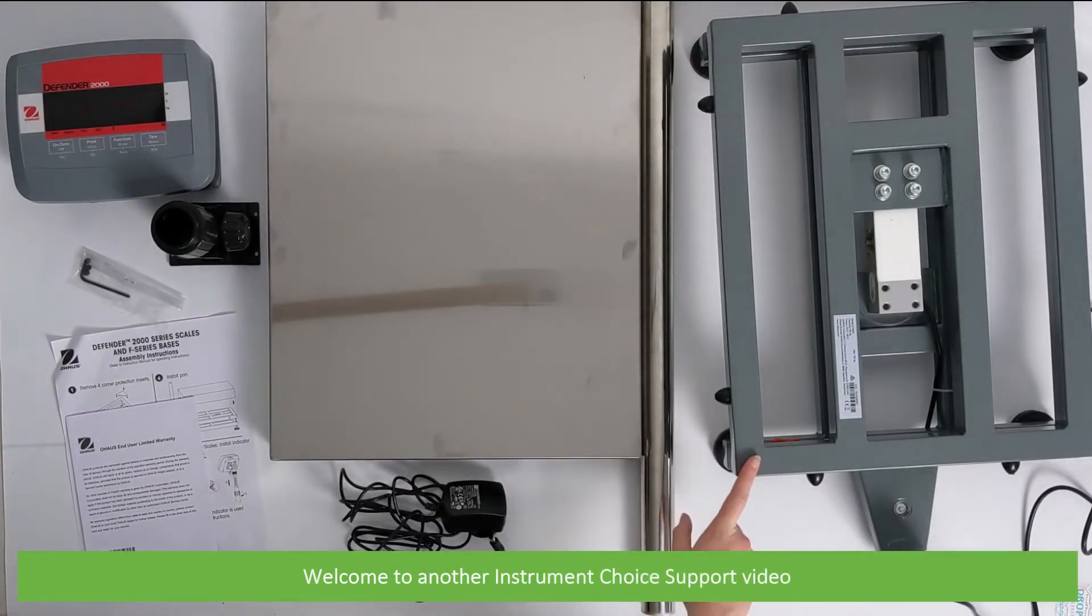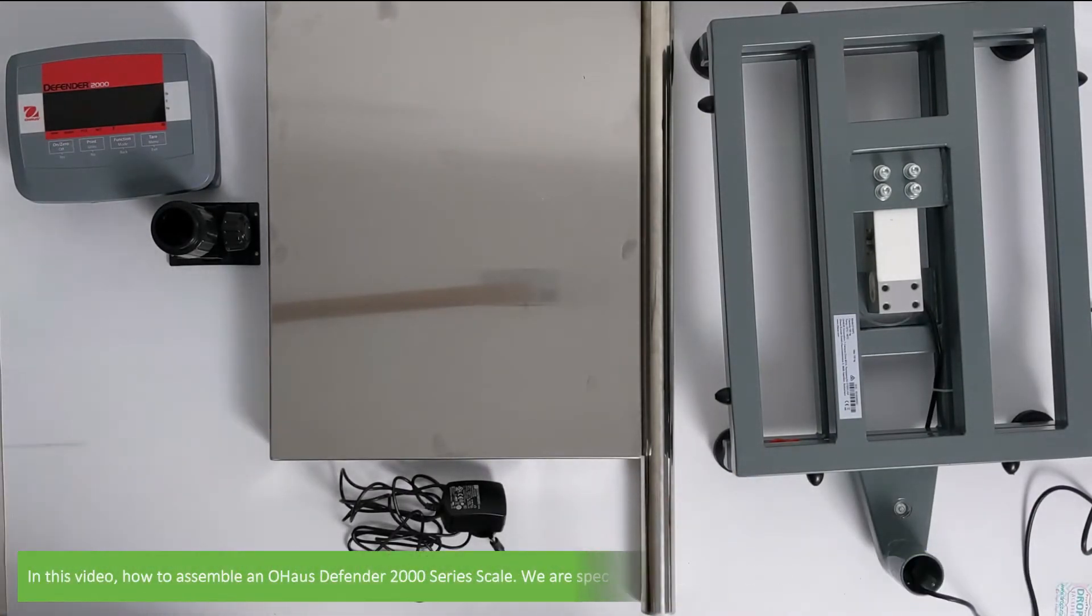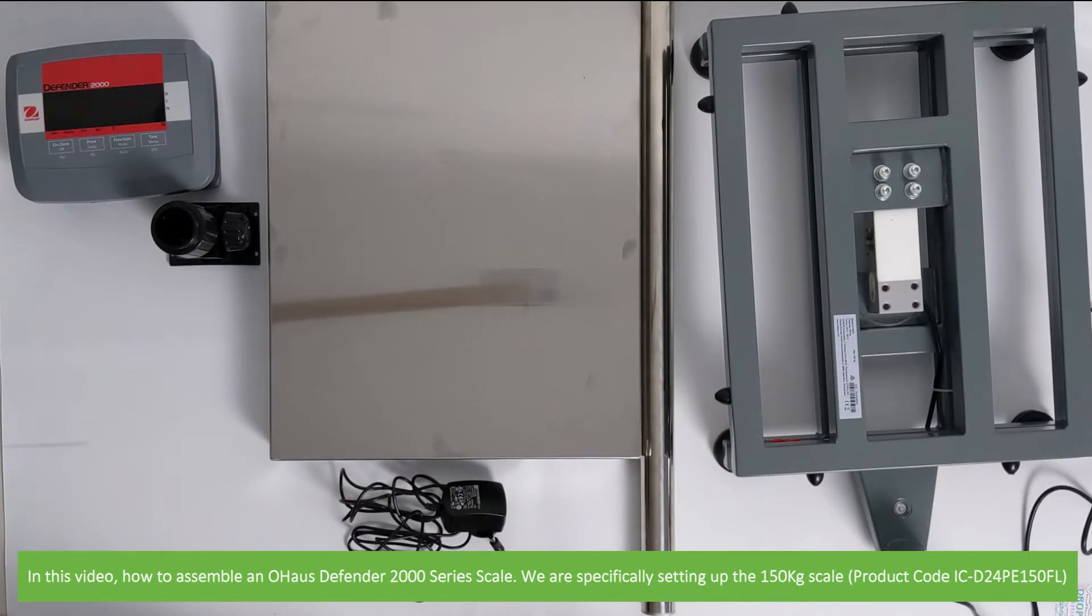Hi and welcome to another Instrument Choice support video. In this video we'll show you how to assemble an O-House Defender 2000 series scale. We are specifically setting up the 150 kilo capacity scale, the product code ICD24PE150FL.